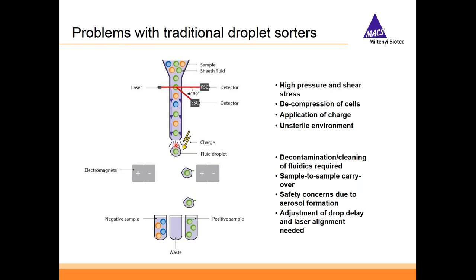And directly afterwards, there's charge applied to the droplets in order to redirect them in that electrical field into either the negative or the positive samples. And of course, all these things are stressful for the cells. In addition, we have an open environment where the droplets are sorted. And this is, of course, also a problem in terms of contamination or safety for the operators.